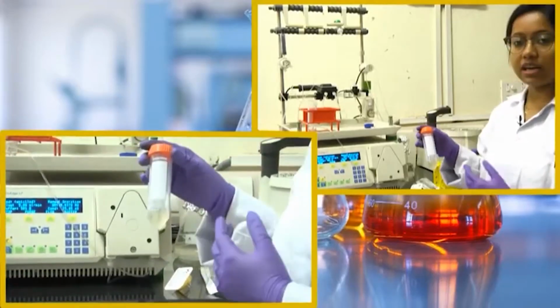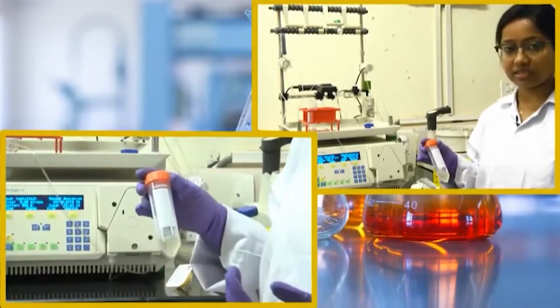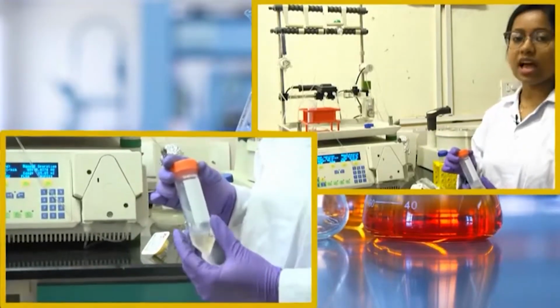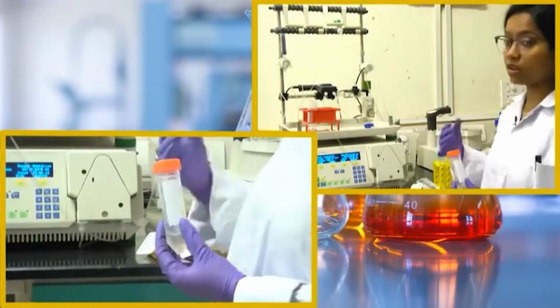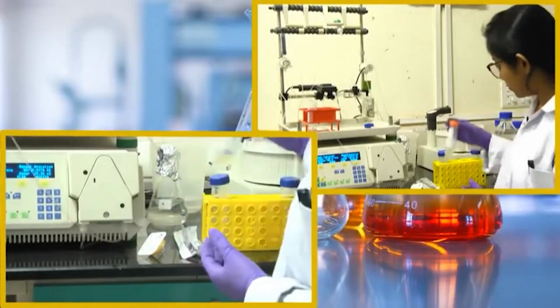But if you are not confident at this particular stage, you can run both the supernatant as well as the insoluble fraction through SDS-PAGE, and when you confirm that your protein is present in either of the fractions, then you run that particular one.